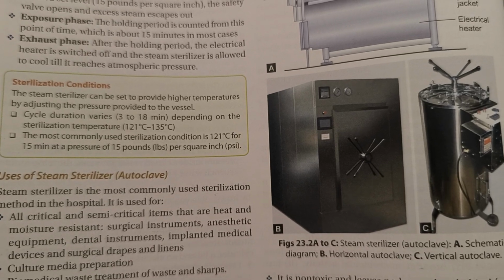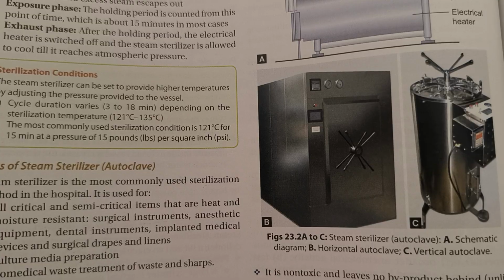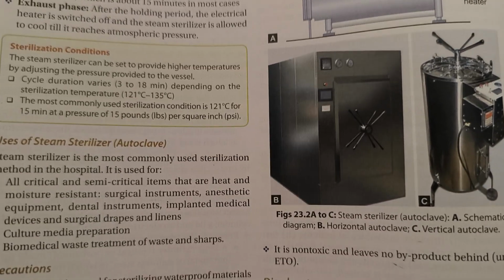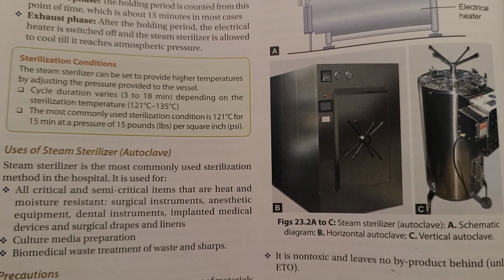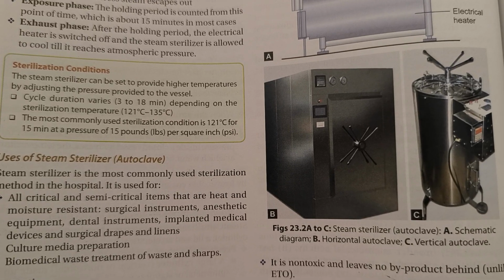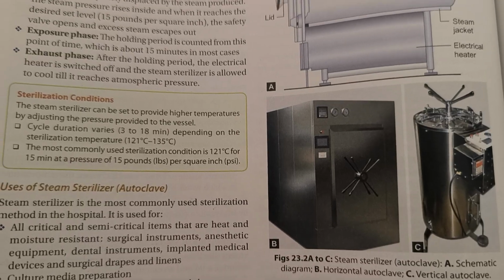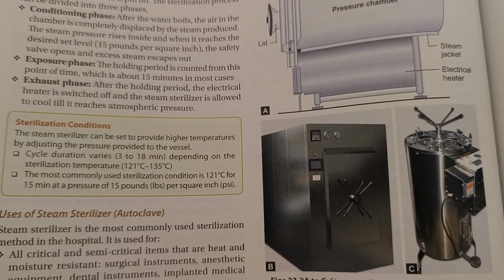The holding period is counted from this point of time, which is about 15 minutes in most cases. Exhaust phase. After the holding period, the electrical heater is switched off and the steam sterilizer is allowed to cool till it reaches atmospheric pressure. These phases are important, so I am reading them again.